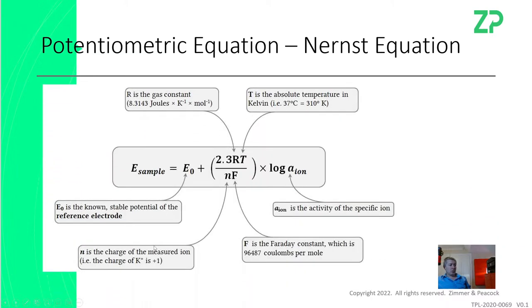First of all, the question was coming up about where the signal's proportional to volume. If you come to one of our workshops, this is a slide I took from the workshop, but the signal, which is the voltage you often measure, is obviously proportional to the concentration. When you look at this equation, which is the Nernst equation, I'm not trying to be fancy or flash, there is no volume in here. So when you look at things like absorption spectroscopy, there's a length scale in there, so it tells you that the amount of sample that the light travels through is part of the signal. With these ion selective electrodes, there's no length in there, there's no volume in there, and there is a concentration because you want signal proportional to concentration, but the volume is not in there.